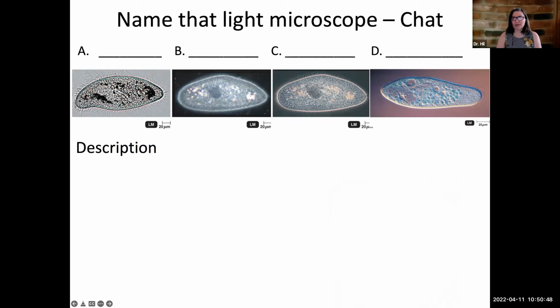Okay, one of the major focuses today, what we want to make sure we cover for sure, is the types of microscopes and what their strengths and utilities are. Now, here are the light microscopes. These are images of the different light microscopes. We have the same organism viewed by these different microscopes. So as we go through these different letters, I'm going to ask you to name them based on the image. Okay, so what is the one shown in A? What microscope was probably used here?